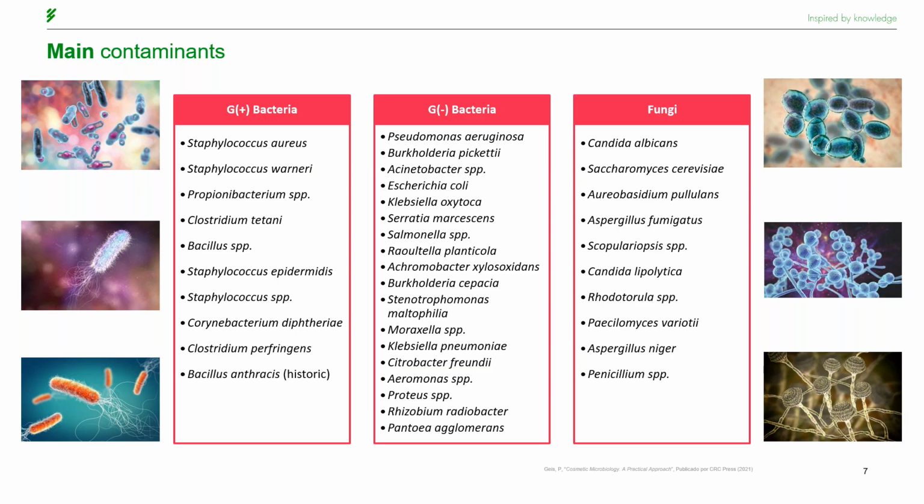So as we can see in this table, the potential microbiological risks are numerous, including both bacteria, gram-negative, gram-positive, and fungi. Some are derived from manufacturing and others from consumer use. However, the range of microorganisms can coincide. Burkholderia and Pseudomonas are the most common production contaminants, and the contaminants from consumers, because of the contact with the product, are usually opportunistic microorganisms which are found on our skin, such as Staphylococcus, Streptococcus, and Corynebacterium.